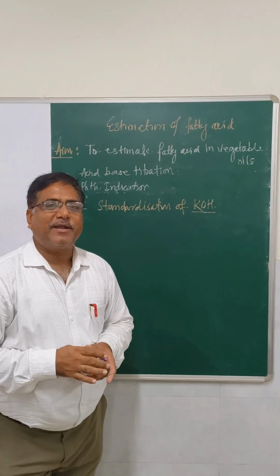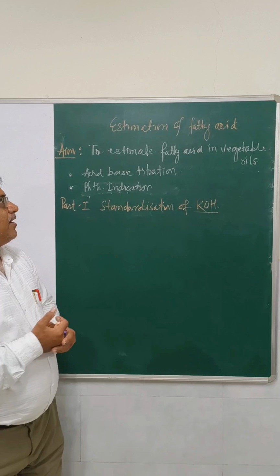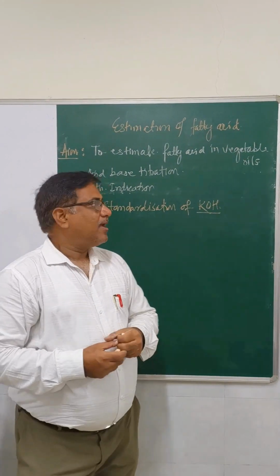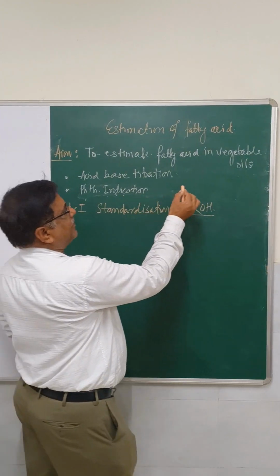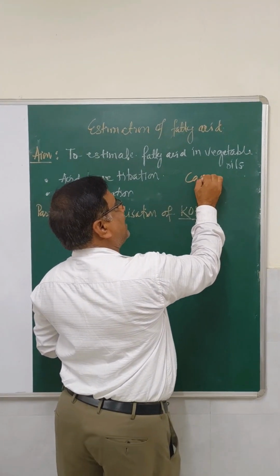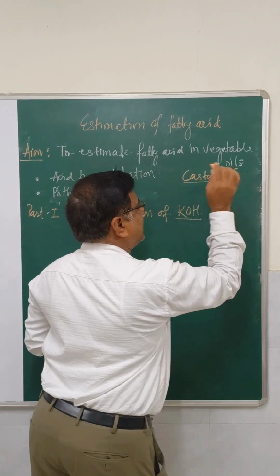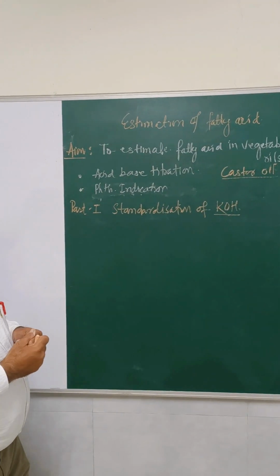Yes, our today's experiment is the estimation of the fatty acids from the given vegetable oil. So today we will use the castor oil for the estimation, because it is a vegetable oil which is very cheap.